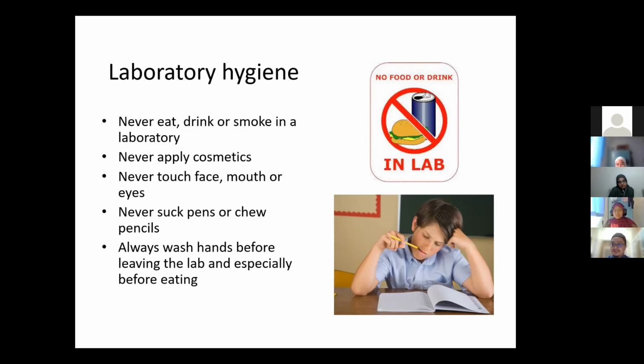So saya pernah tengok even orang yang orang kata dah graduate lah, bila dia nak keluar lab tu, dia basuh dia punya tangan dengan hand sanitizer, lepas tu pergi kafe, dia terus makan, tak basuh tangan. Lepas tu saya tanyalah, kenapa dia tak basuh tangan? Dia kata, my hands are already very sterile, I use hand sanitizer, dia kata. Aduh, tak tahu lah nak kata macam mana, but it's not a good lab practice.